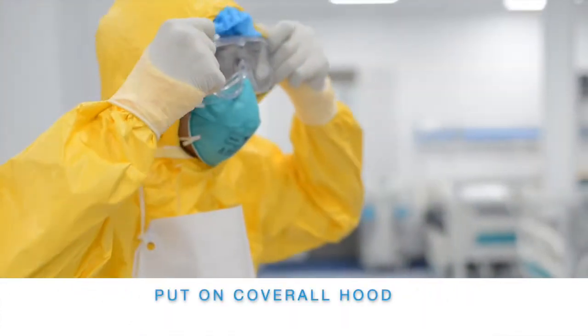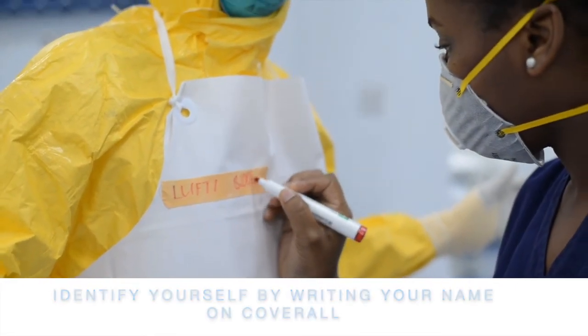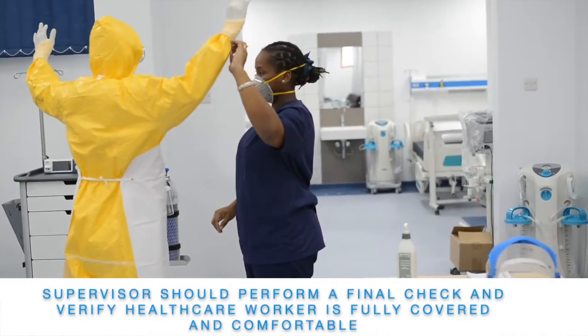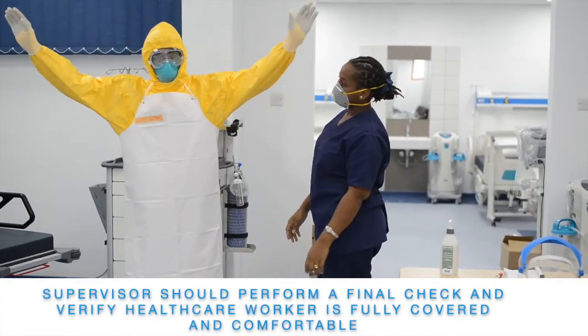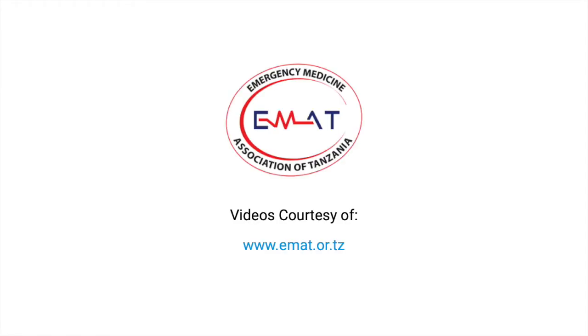Put on the coverall hood. Identify yourself by writing your name on the coverall. Supervisors should perform a final check and verify that healthcare workers are fully covered and comfortable.